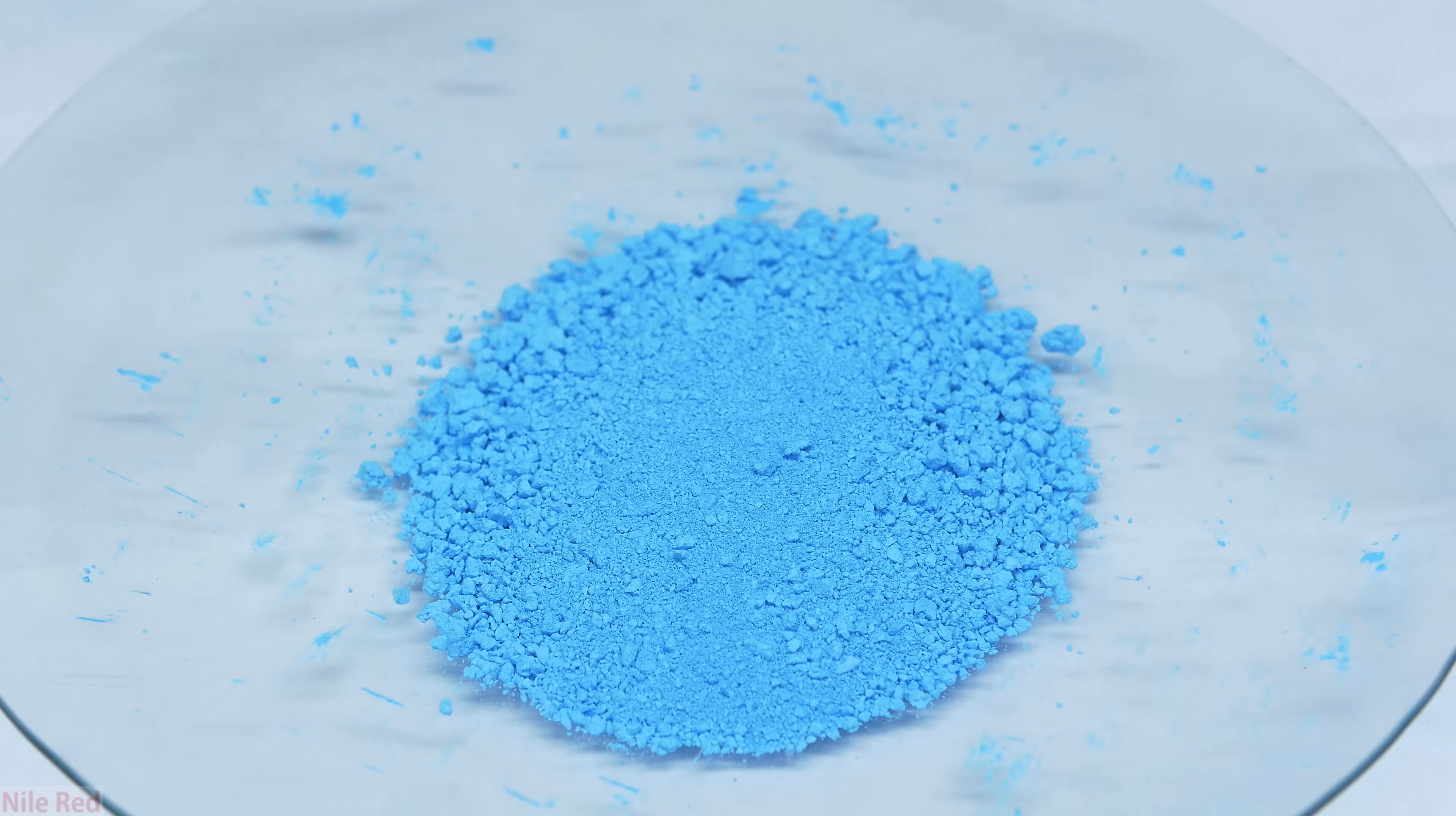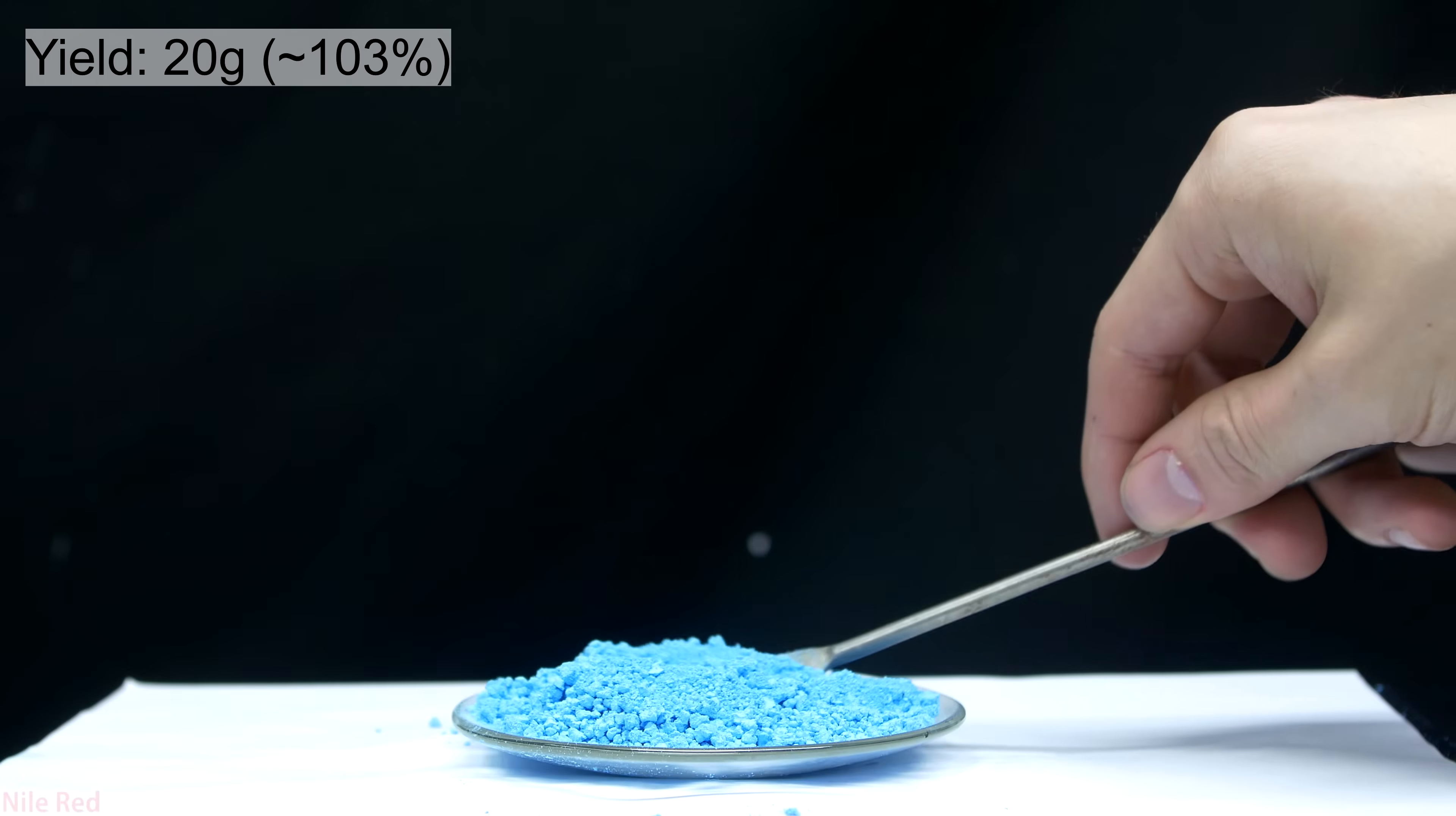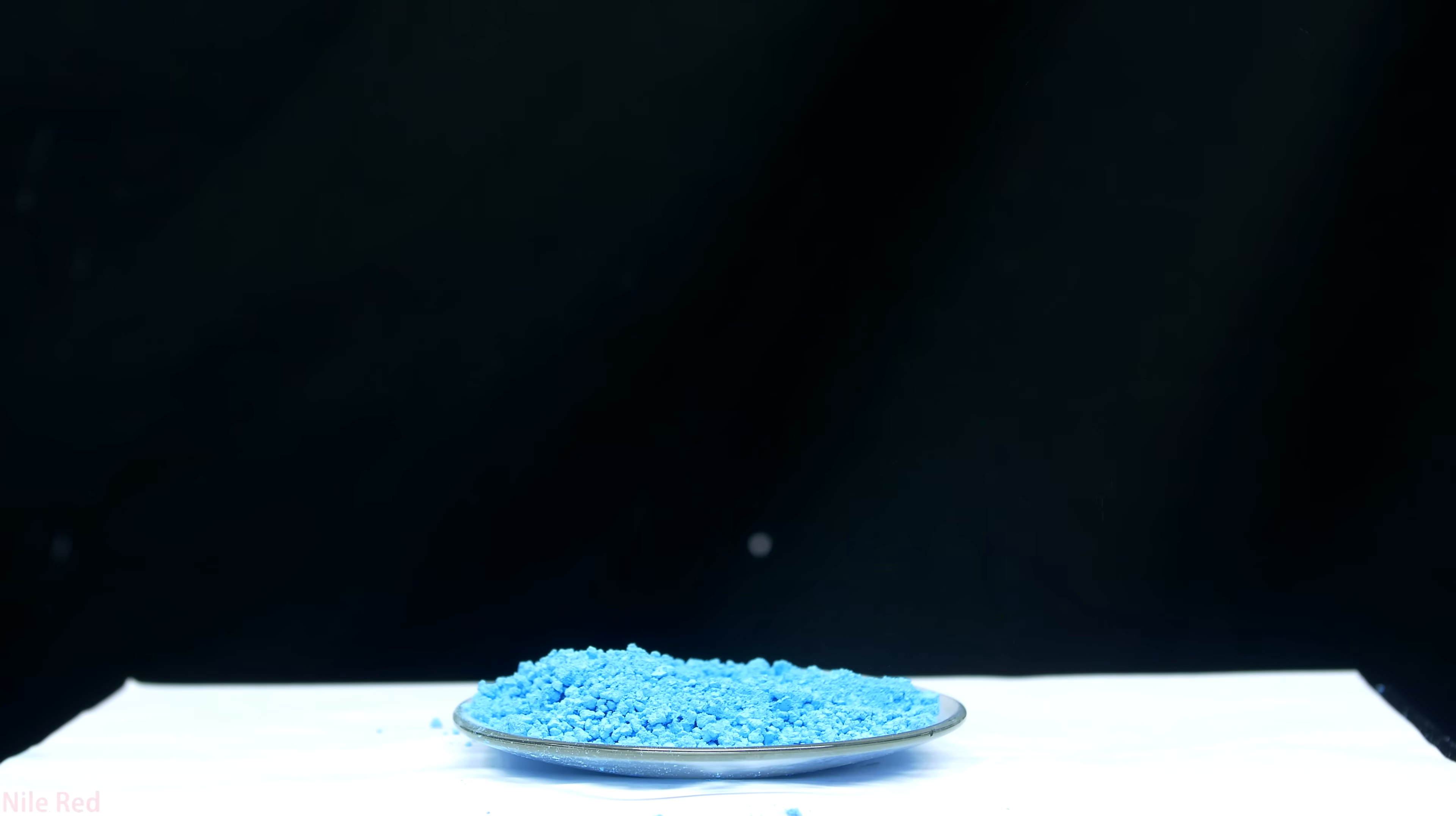Eventually I was left with nice, light, blue copper hydroxide powder. The yield in the end was about 20 grams, which is actually above 100% yield, which to me indicates that the powder is still probably a little bit wet. This is okay though, because we're using the copper hydroxide to make Schweizer's reagent, which requires mixing it with aqueous ammonia.